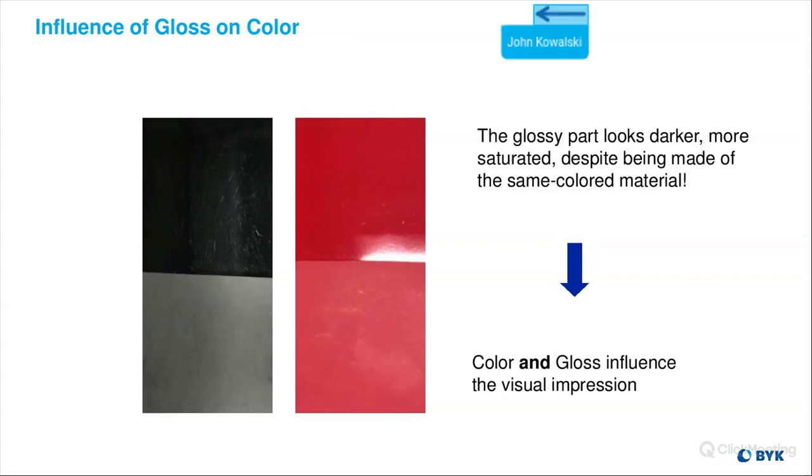And then you can put values on how that texture is behaving, the spacing between, we'll call it, hills and the valleys, how large those hills and valleys are, how tall they are, the depth of them. And it puts it into numbers to quantify what you're looking at. And what's nice about quantifying it is now you can put quality control measures in place with tolerances. And so you can essentially research into what you're measuring and then create your process based off of that.